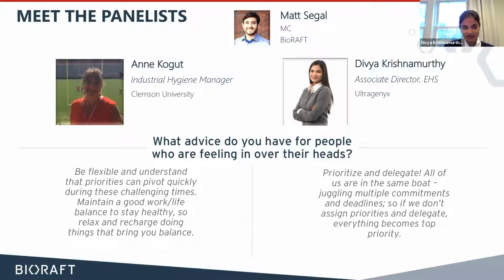But that being said, the smaller scale reactions are also equally hazardous. So in addition to that, we also put in exactly what the requirements are for each one of these. Which ones can you run by yourself? Which ones do you need additional personnel? And there's the gray area, where you don't need additional personnel, but you have to check in with someone at certain time points. So we divide it up in that way, and make that information available easily to everyone.